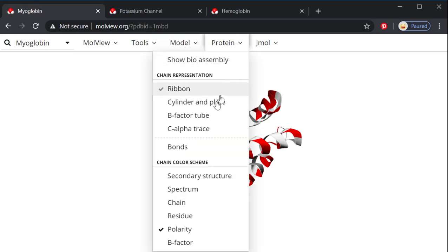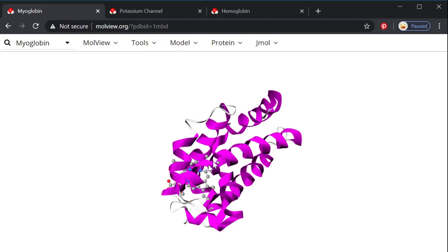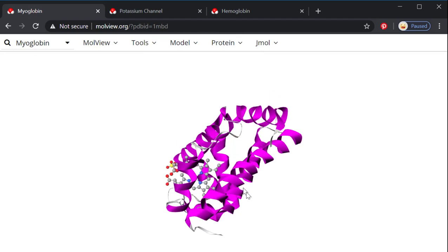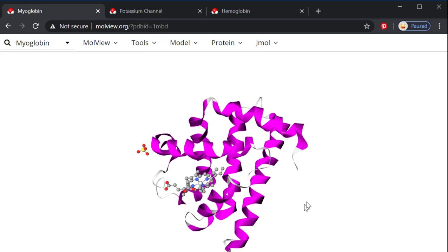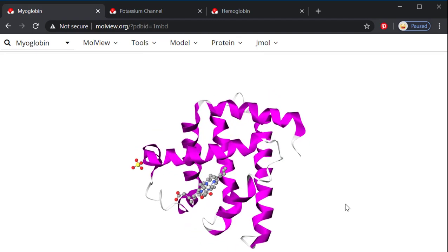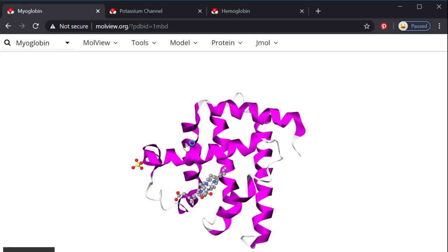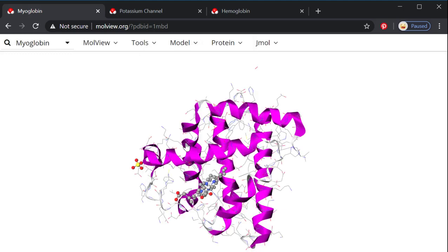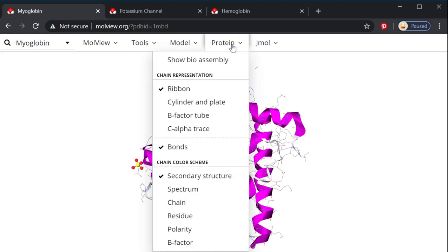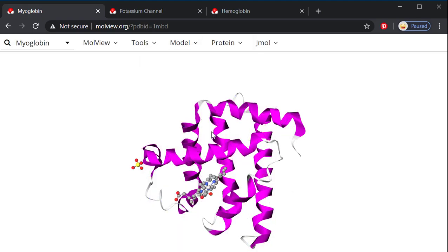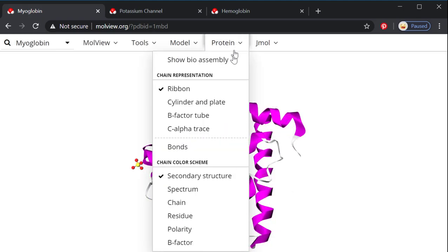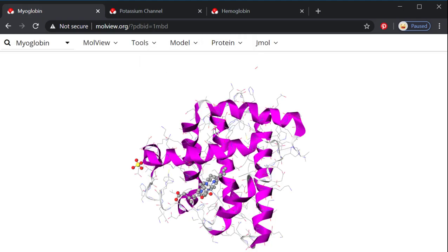Let me just show you one more thing here. So I'm going to go back to secondary structure. And this is just showing, again, secondary structure coiled up into tertiary structure, right? But there are side chains coming off of all these helices. And so if I do this structure, this picture, so again, that was into protein and bonds here. Now they're gone and now they're back.